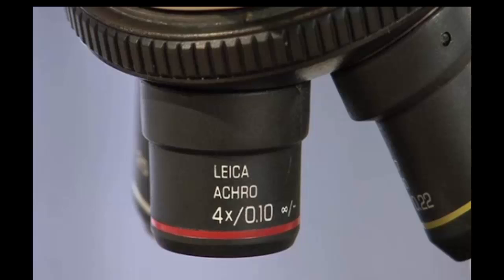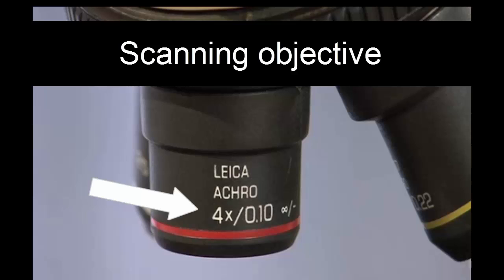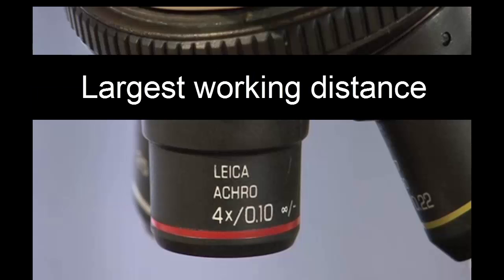The smallest objective lens is the 4x lens, which is referred to as the scanning objective. It magnifies the image four times its original size and has the largest working distance.